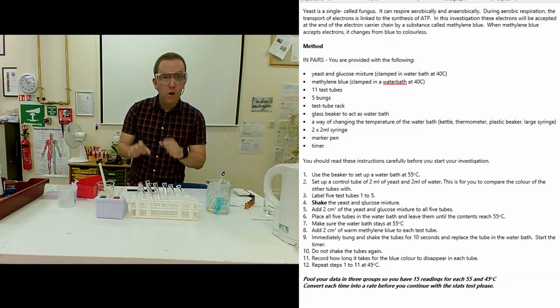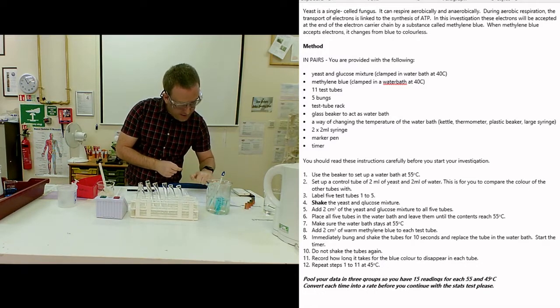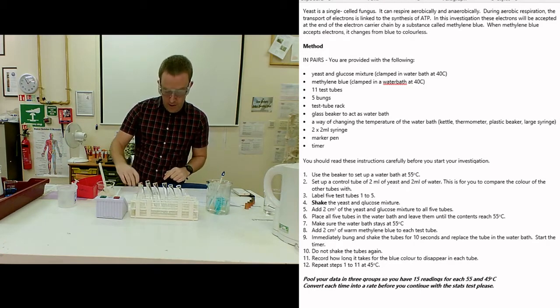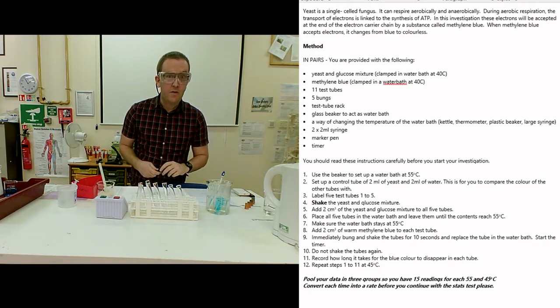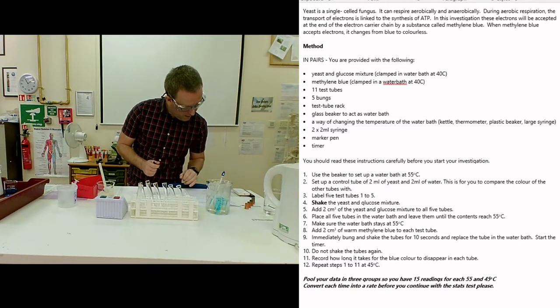Next, label tubes one to five. Well, I've done that and popped them in there. You should have seen me labeling up tubes - it's not something I do often anymore, it's barely legible, but they're all labeled up.